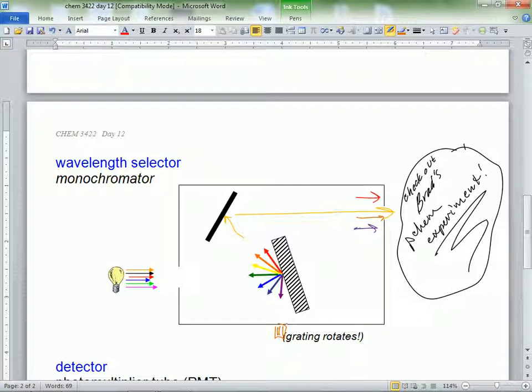This is why we can't touch it. Once he marks, oh, that's orange, that's green, that's violet, with a pencil and writes down the wavelength according to what Google says, he can shine whatever light he wants through here. And if that light strikes that position, he knows exactly what the wavelength is. So it's nice and calibrated. That's why we can't bump anything.